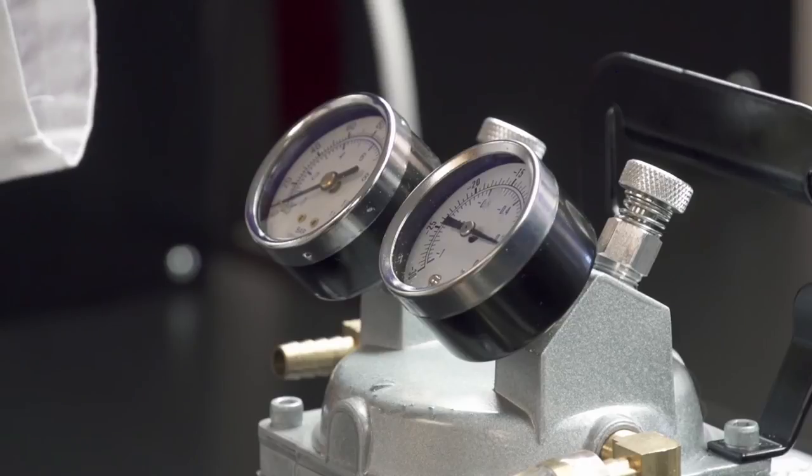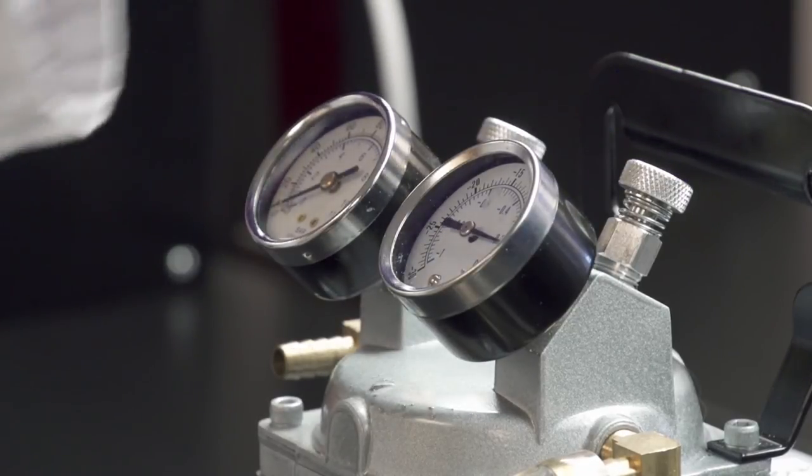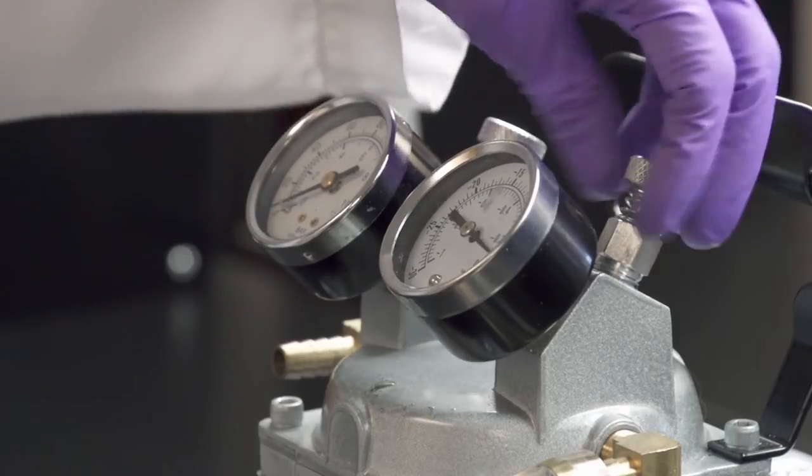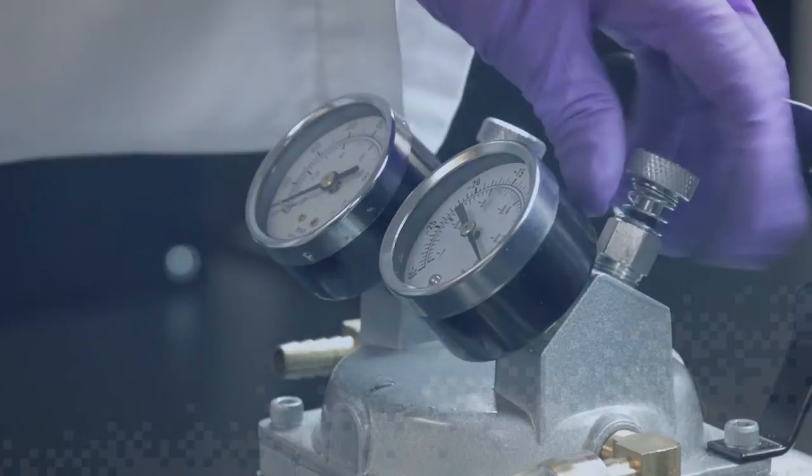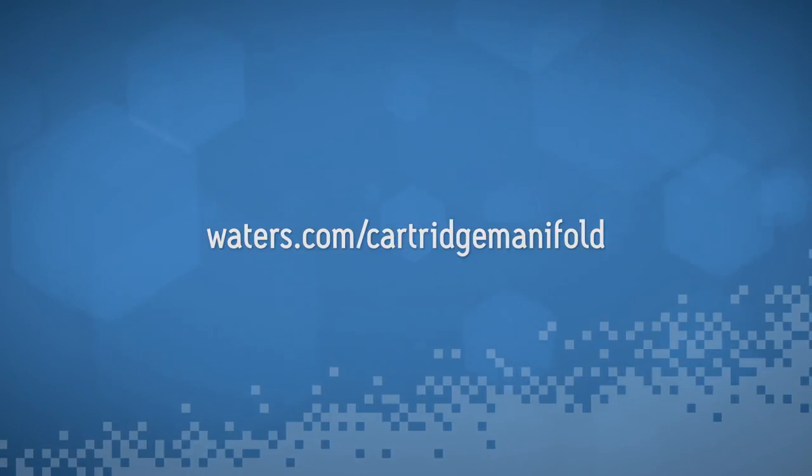Once all the liquid has been drawn through the cartridge, adjust vacuum to zero and turn off the vacuum pump. For more information on Waters 20 position cartridge manifold or to order, go to waters.com slash cartridge manifold.